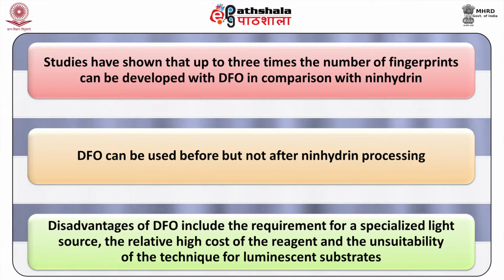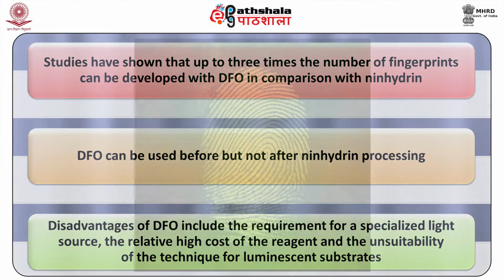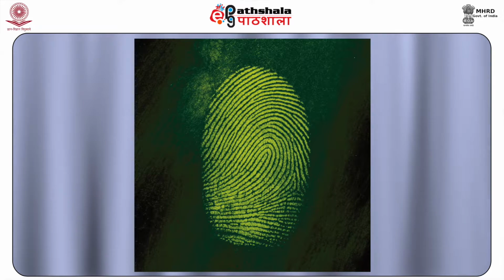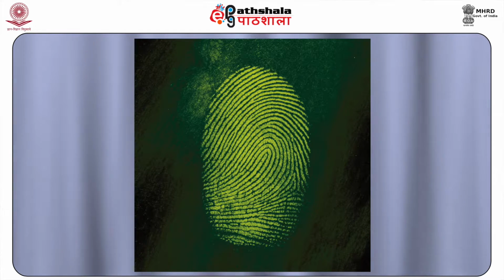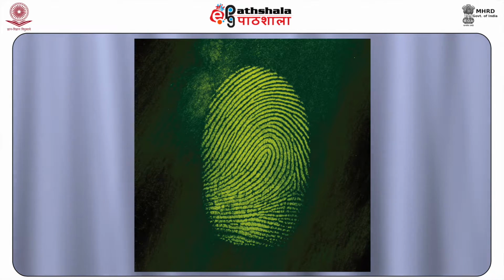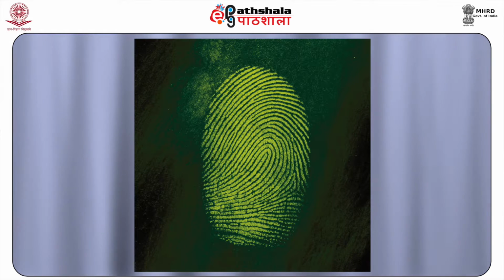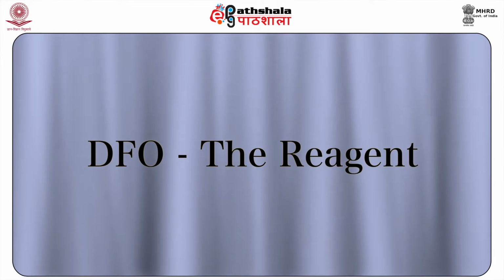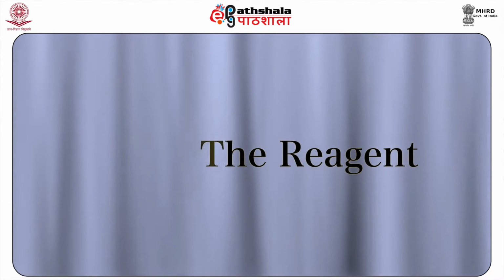The disadvantages of DFO include the requirement for a specialized light source, the relatively high cost of the reagent, and the unsuitability of the technique for luminescent substrates. A fingerprint developed with DFO is less visible in white light than after treatment with ninhydrin, but with green light, it fluoresces strongly. The fluorescence is viewed and photographed through an orange or red filter. Now let us see DFO, the reagent.